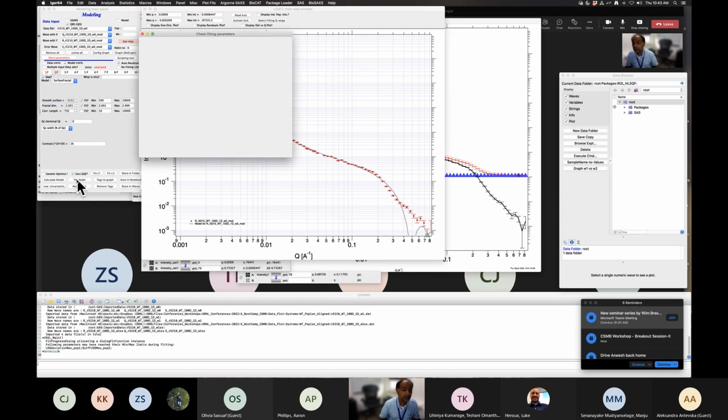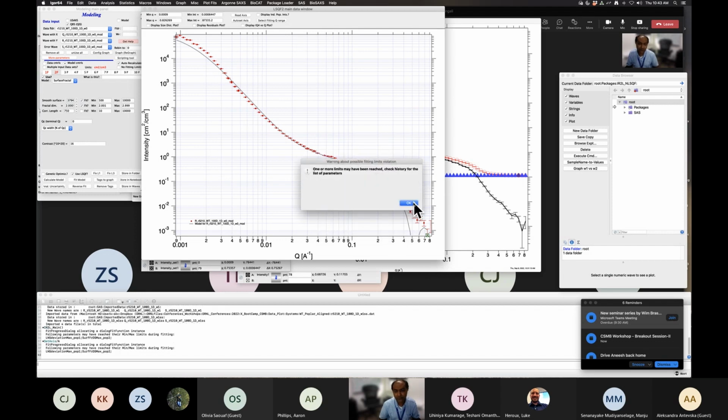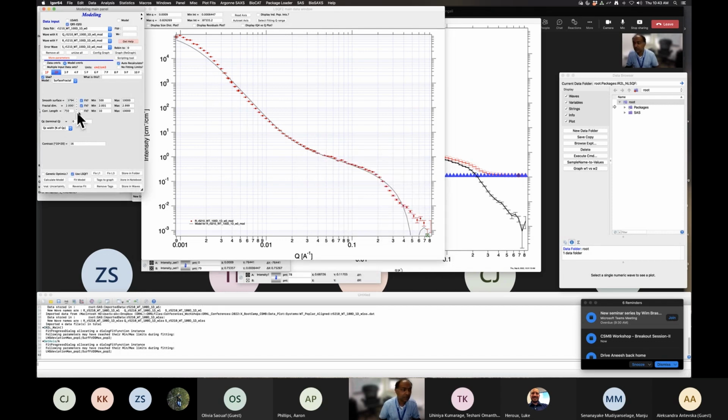It may not, because then this may not capture. Let's try that. Yeah. So if it's capturing that, it's not getting this power law. That's what's happening. So if I use that, oh, I shouldn't allow that to vary. I'm sorry. Once it's hit its limit, I'm going to put this as that.